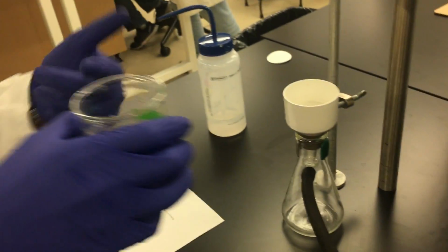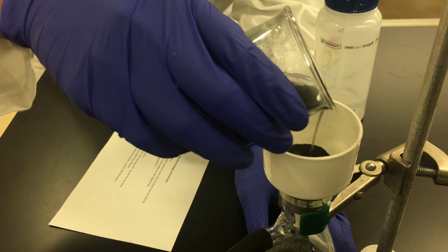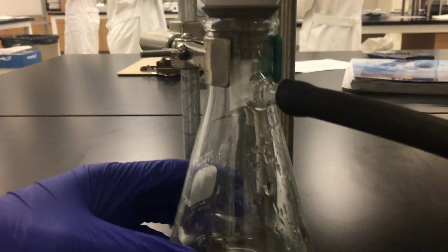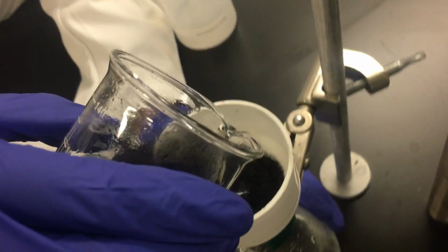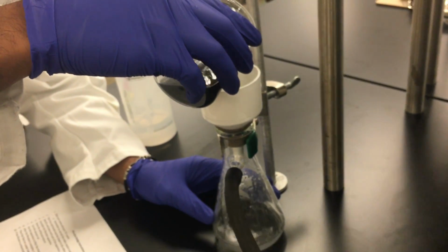And in order to make sure that none of the activated carbon goes around the edges, we're going to pour the solution really slowly. So if you want to get it from this angle, we're going to make sure it's mixed, it's all well distributed, and we're going to pour it slowly. And watch as the water goes through the filter paper based on the vacuum, and all the filtrate comes out clear at the bottom, while the activated carbon, which is our precipitate, is going to sit at the top of the filter paper. Again, we're pouring it slowly to make sure that we have all the activated carbon sit on the filter paper.